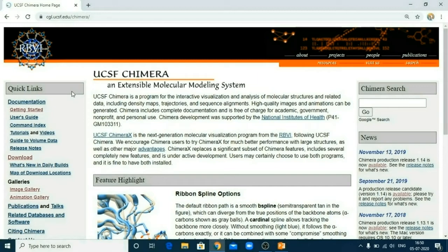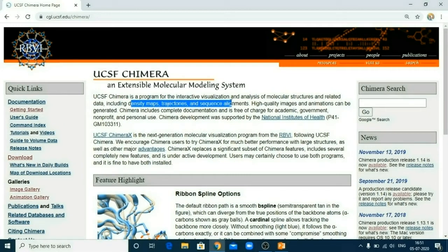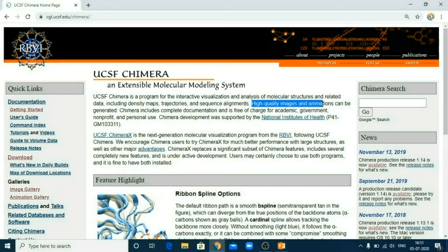Now friends, what is this UCSF Chimera? As I said, it is an extensible molecular modeling system. UCSF Chimera is a program for the interactive visualization and analysis of molecular structure and related data, including density maps, trajectories, and sequence alignment. Not only for analyzing various molecular structures and all related data, but also UCSF Chimera can be useful for generating high quality images and animations, which is not possible with any other software individually.